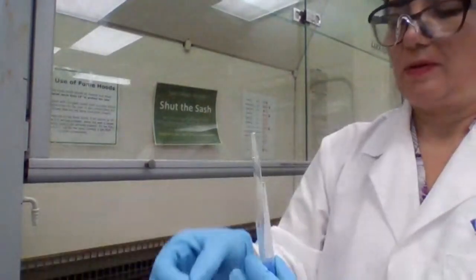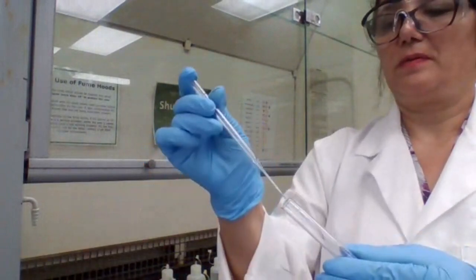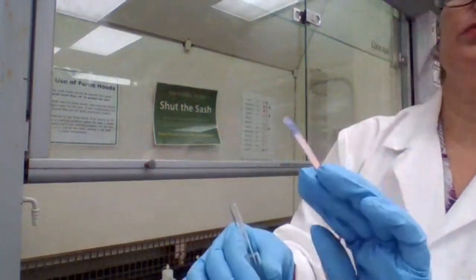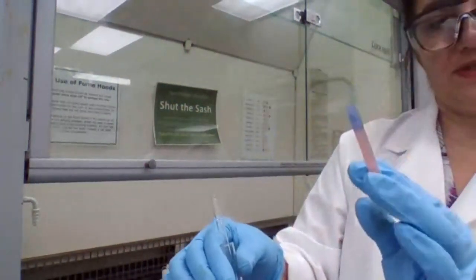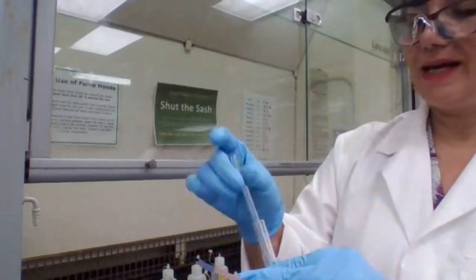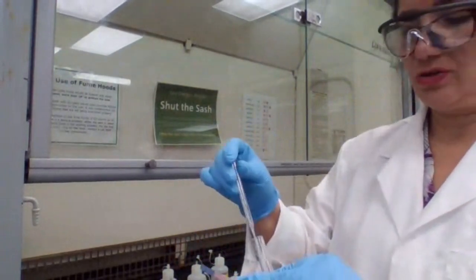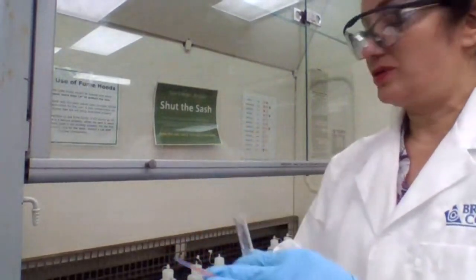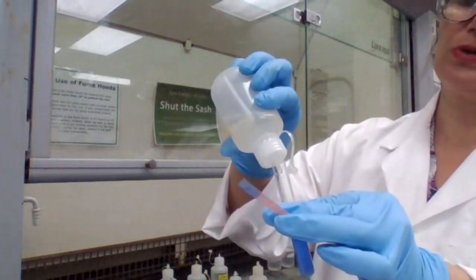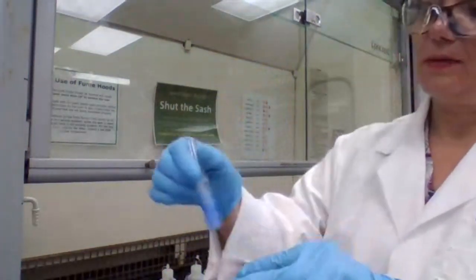Take a drop, place it on the litmus paper. Okay, the red litmus paper turned blue. What it means is that the solution is basic. And it says after it is basic, just to make sure you have added enough, add 3 extra drops. So we're going to add 3 extra drops to make sure. 1, 2, and 3. Okay.